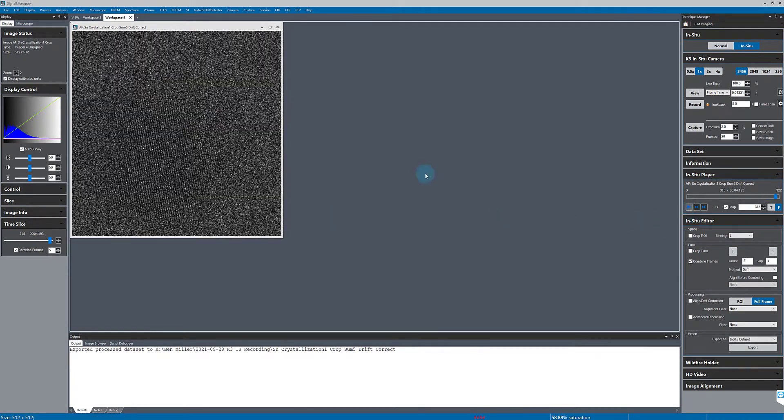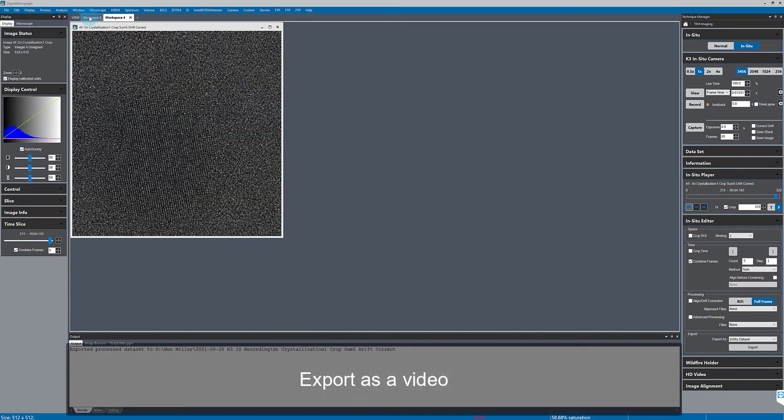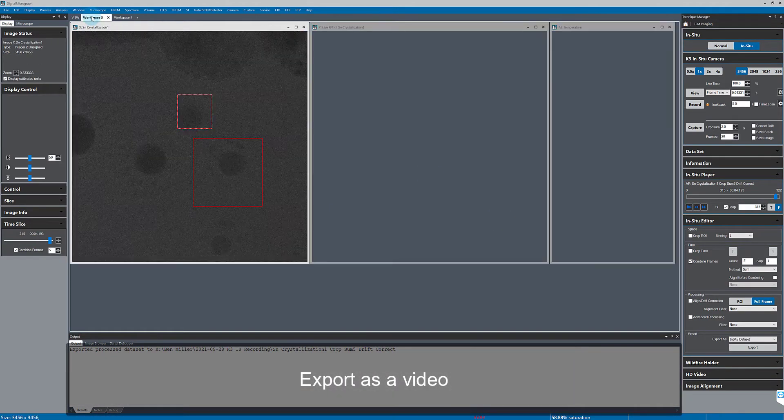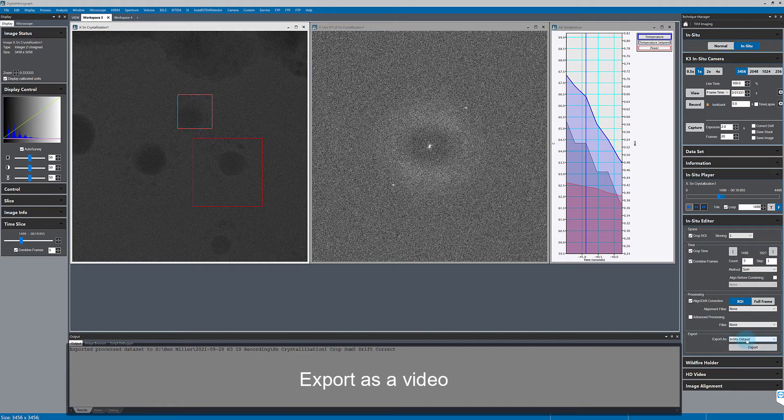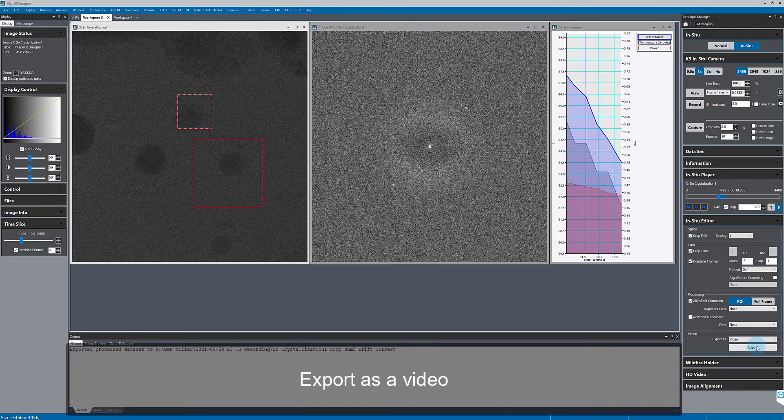I can also export the same data but save it directly to an mp4 video by selecting video here in the IS editor.